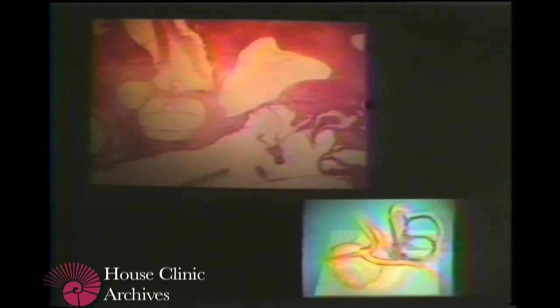There is an anomaly in this temporal bone in that the chorda tympani is taking off quite high, actually above the stapedial muscle. The origin of the chorda can occur anywhere from this level to outside of the temporal bone. Here we see the lenticular process of the incus, the malleus handle.